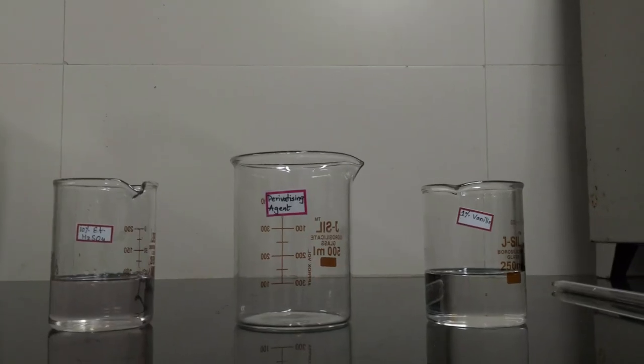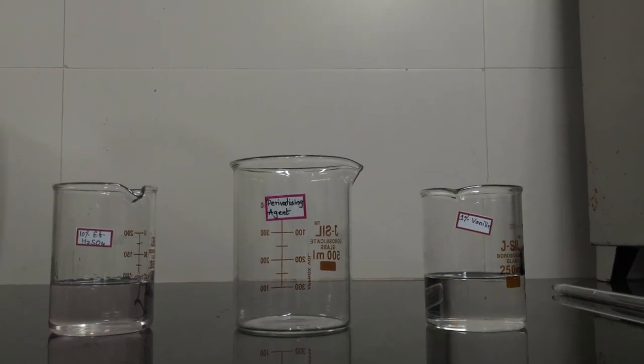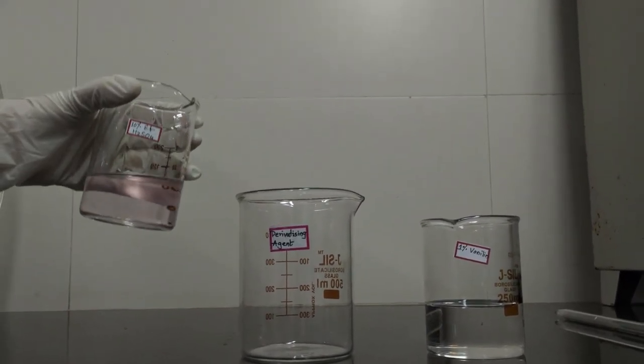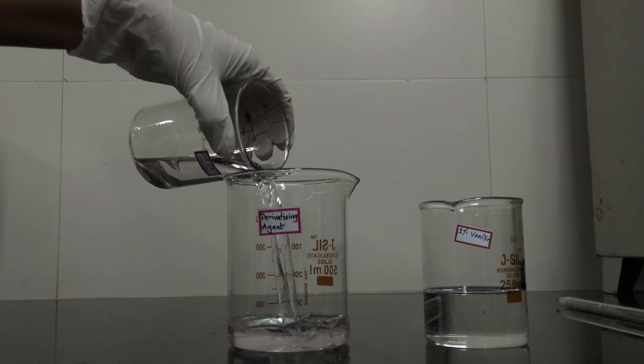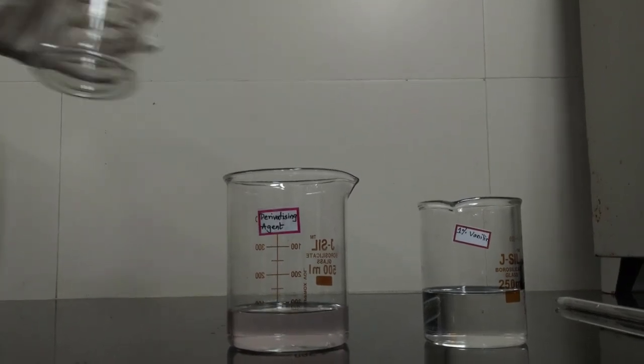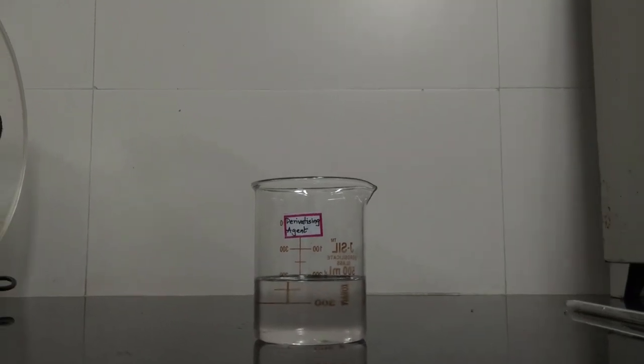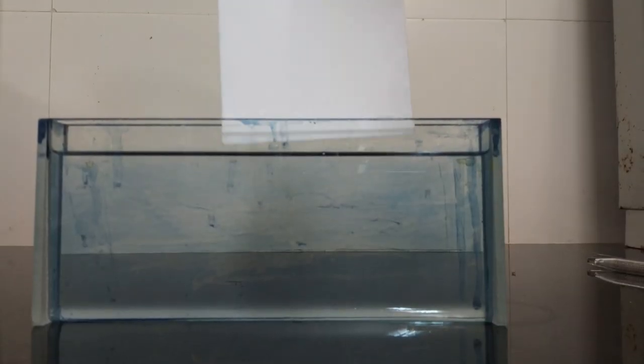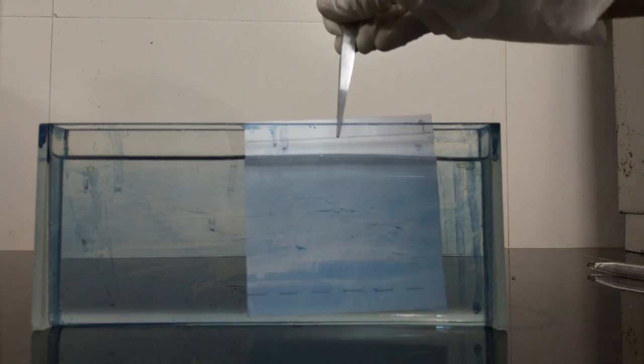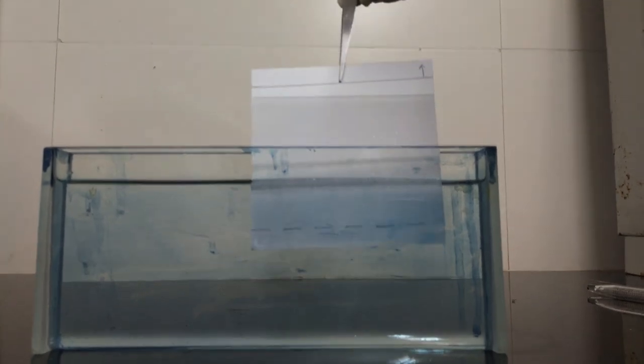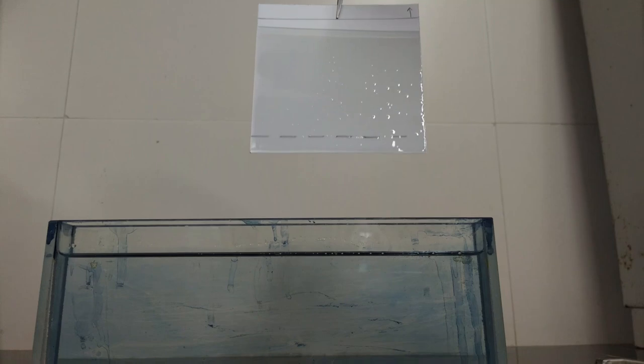The derivatizing agent used is vanillin sulfuric acid, which is prepared by dissolving 1 gram of vanillin in 90 ml of IPA and 10 ml of H2SO4. Out of the two methods, which are dipping and spraying, we will be using the dipping method, following which we will be keeping our plates in the oven at 110 degrees Celsius because the reaction takes place at this temperature.